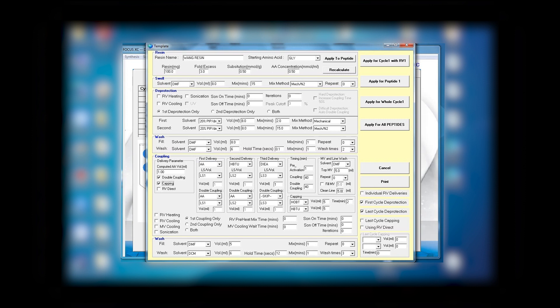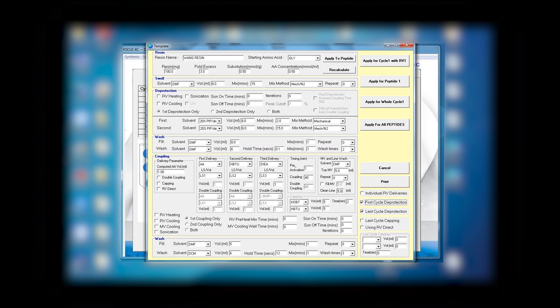If you go to the right and you want first cycle deprotection, you can select it. If you do not, because sometimes you have Rink amide resin that could have no Fmoc, you just deselect it and it will not deprotect. But since we have a Wang resin, we select first cycle deprotection. The last amino acid on cycle, you can remove the Fmoc amino acid or you can leave it on, whatever you like to do. These options are available so you can use them exactly the way you like.